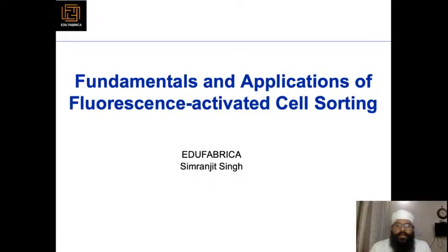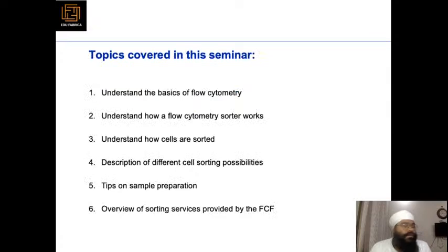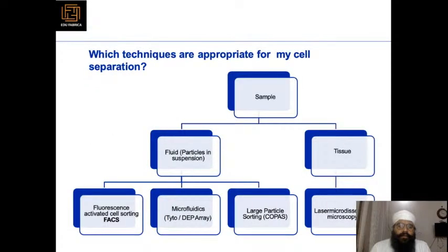Fundamentals and applications of fluorescence activated cell sorting. Topics covered in this seminar: we have to understand the basics of flow cytometry, understand how a flow cytometry sorter works, understand how cells are sorted out, a description of different sorting possibilities, tips on sample preparation, and an overview of sorting services provided by FCF.